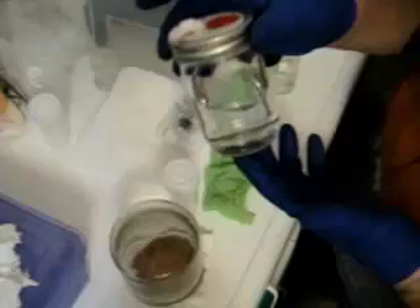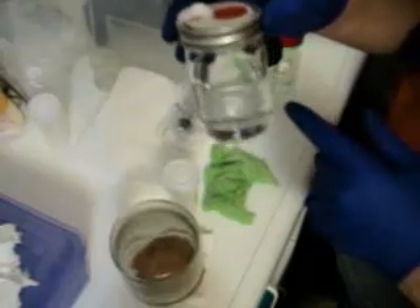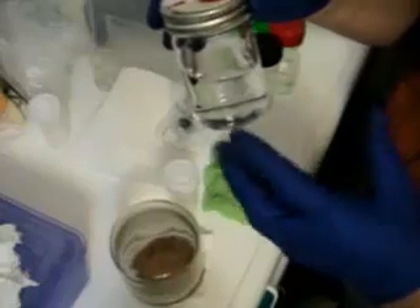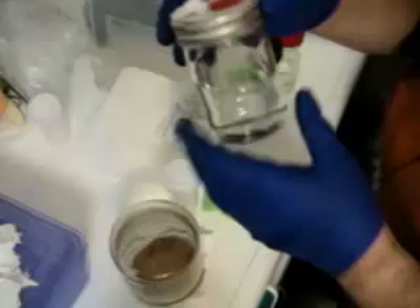Let's talk about how to make a spore syringe. You're going to need some sterilized water — distilled or filtered water that I put in a jar and pressure cooked for 90 minutes at 15 psi, along with other jars of grain and media.